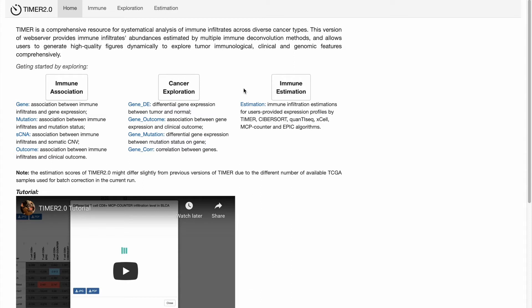TAMR2 can also help estimate the immune cell infiltration for user-provided expression profiles using six state-of-the-art algorithms. Next, I will introduce how to utilize TAMR2 in cancer research.